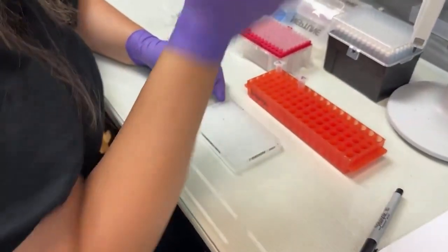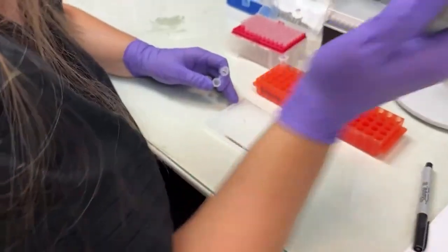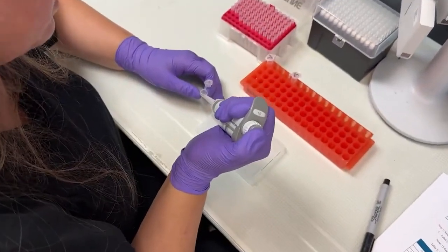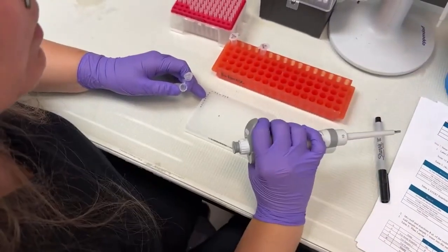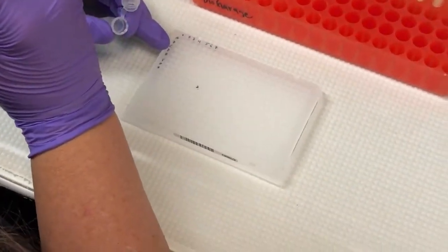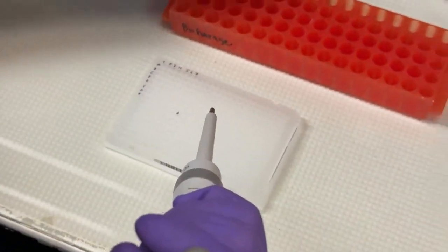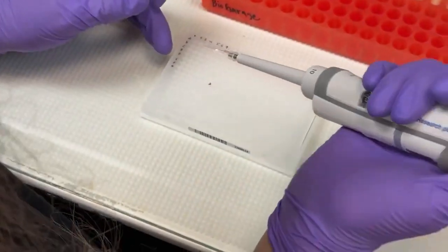Some other useful techniques are to coordinate the tips you're using to correspond to the plate format. That way you know if I used that tip, I completed the sample addition.